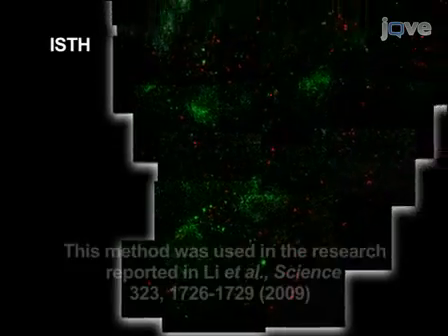Today, we will show you a procedure for in situ tetramer staining and the in situ hybridization, or ISTH for short.